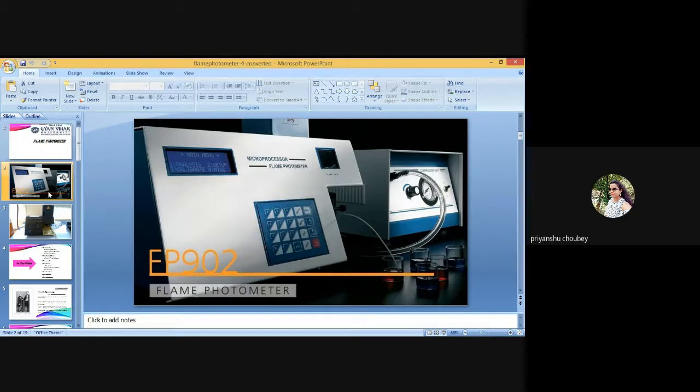The use of improved burner systems, high dispersion monochromators, and nitrous oxide acetylene flame markedly improved the performance of this technique by improving precision and the detection limit capability for many other elements, while at the same time minimizing certain types of interference.